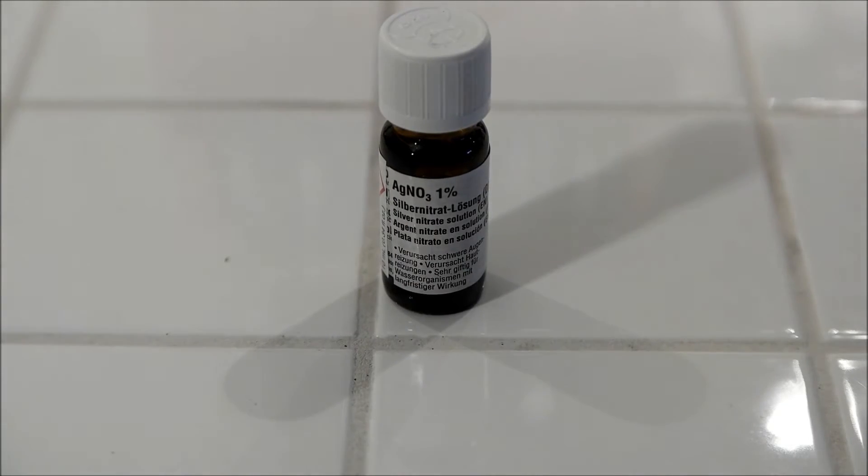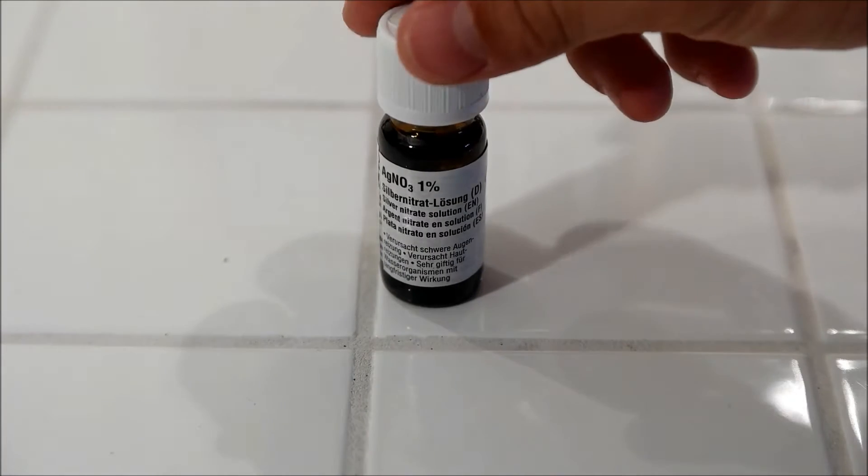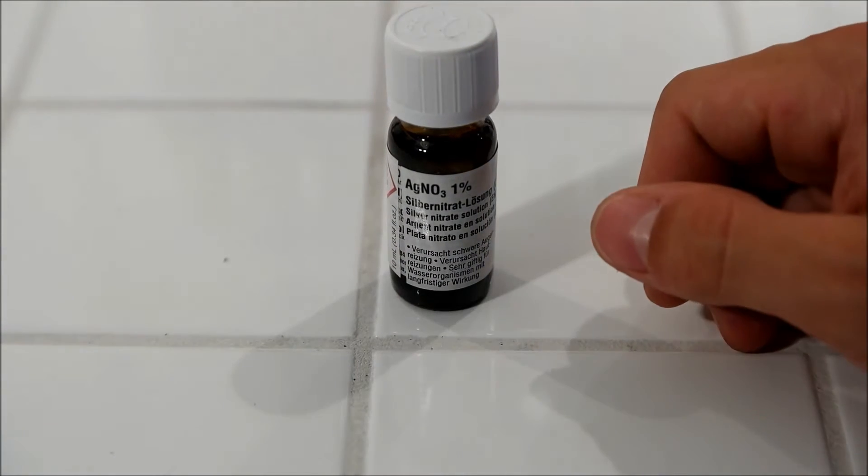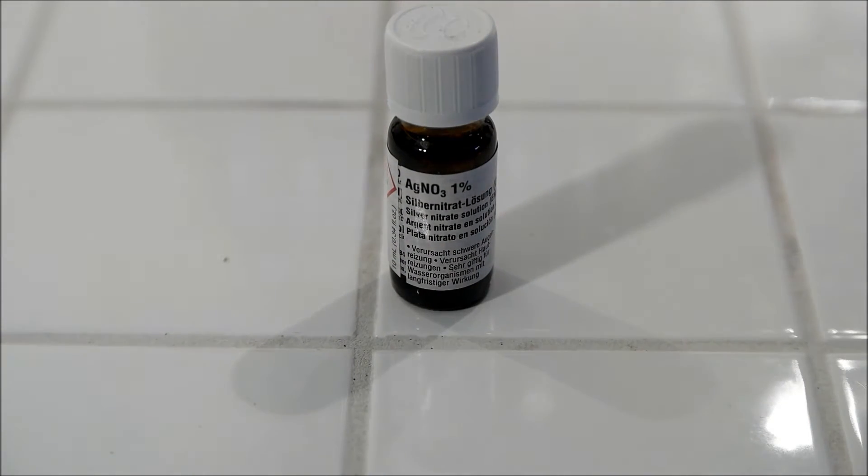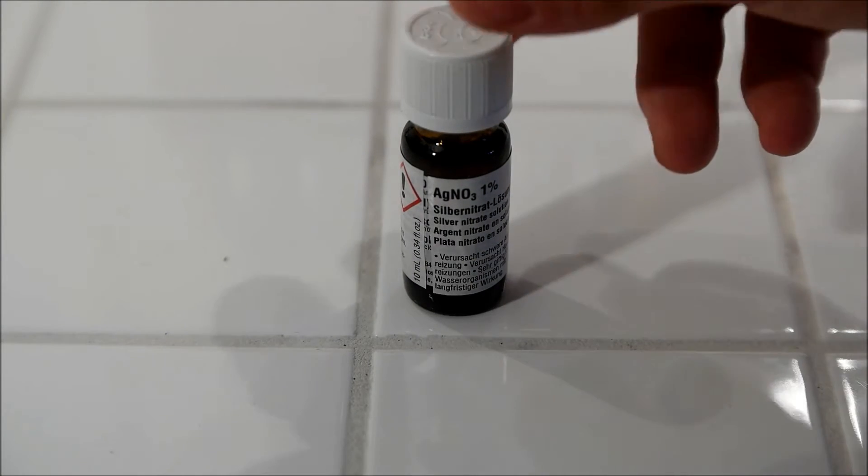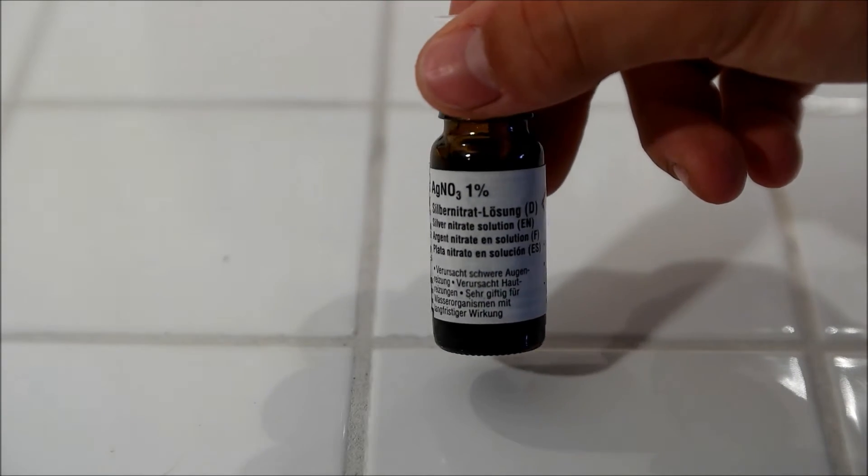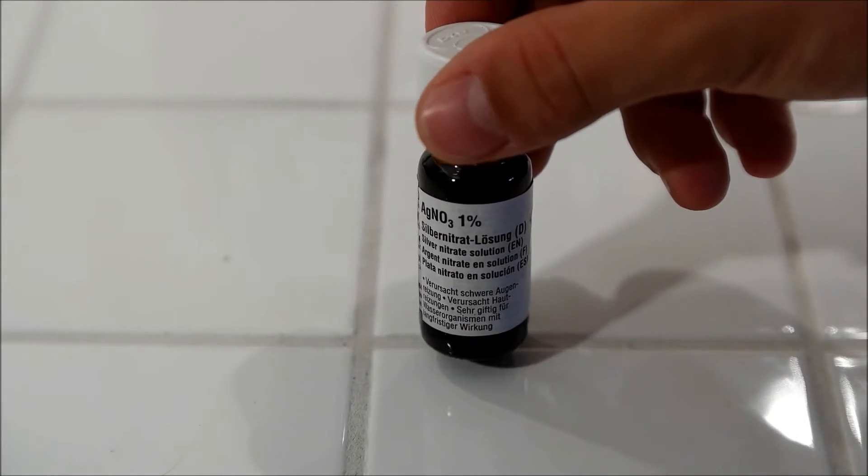Today I show you how you can use a silver nitrate solution, this one has around 1%, as a detection reagent for chloride salts. To get this, I just dissolved pure elemental silver in concentrated nitric acid and made a 1% solution of it.